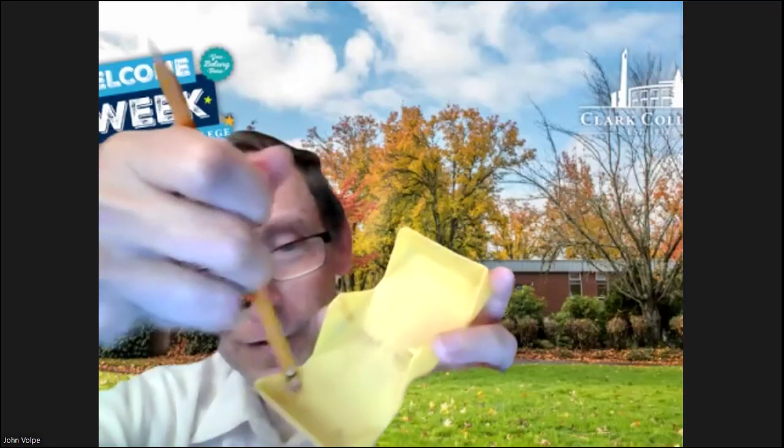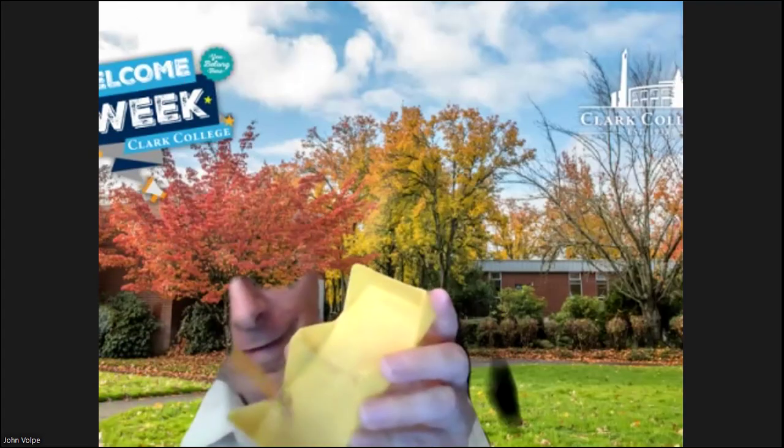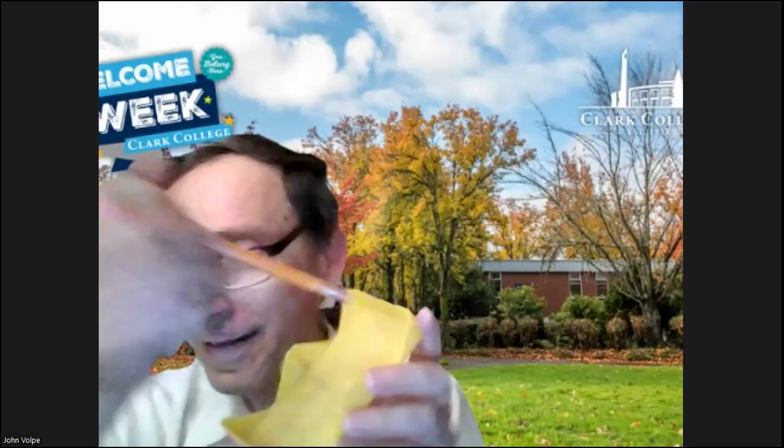So you go around the entire edge of the plate. It only shows when I have my face there, so that's the problem. That way you put bacteria everywhere on the plate, and then it will grow a lawn of bacteria.